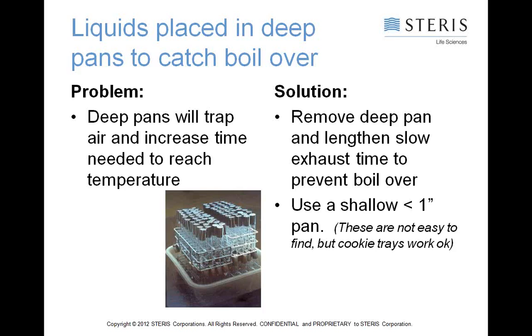And then I was just alluding to this. Watch your liquid come-up time. Understand that the amount of time required for liquids to come to temperature can be significant. So you can approach it one of two ways. One is to use a load probe. You can see a load probe stuck into this. It looks like they were missing the cap with the hole in it. But it's just to test and make sure your water is coming up, or your liquid is coming up to temperature.